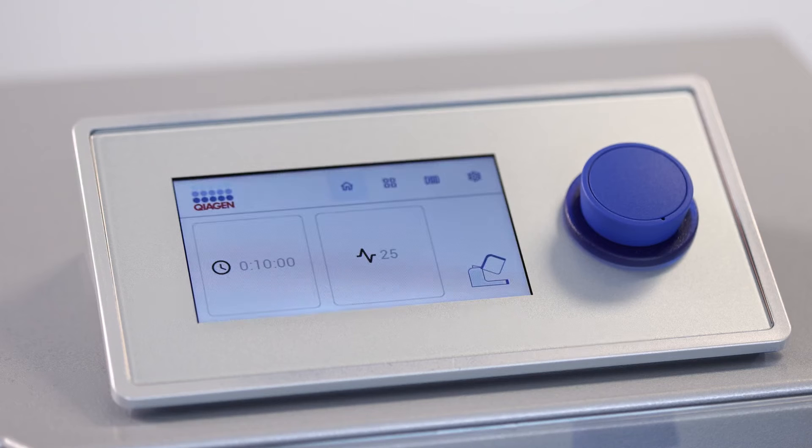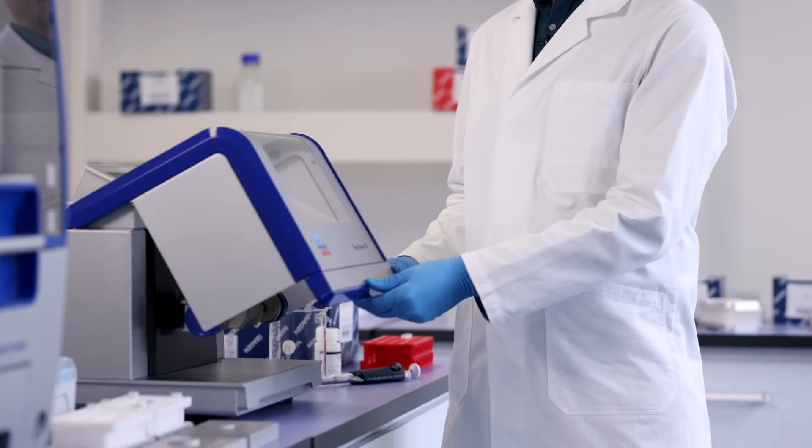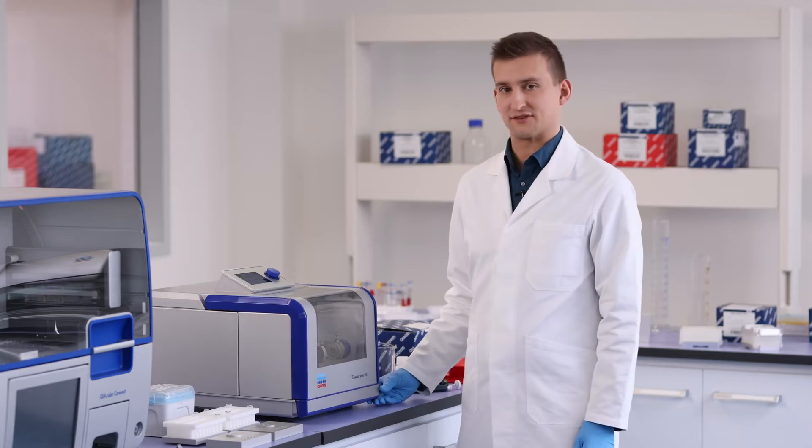Now that it is plugged in, switch on the power at the back of the instrument. Wait for boot-up, then open and close the hood once to engage the safety sensor. And that's it — you're ready to use your Tissalizer 3 for effective sample disruption.